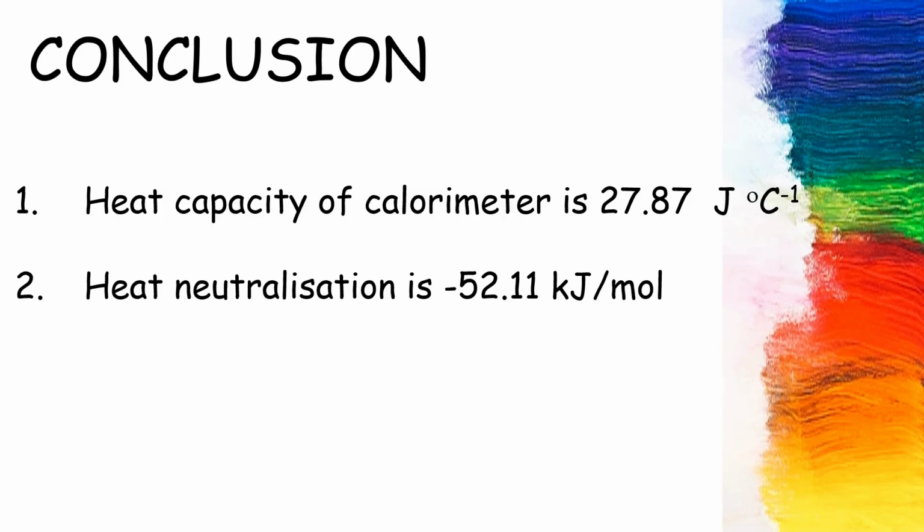Conclusion, we can say that the heat capacity of the calorimeter is 27.87 joule per degree Celsius and heat of neutralization is negative 52.11 kilojoule per mole.